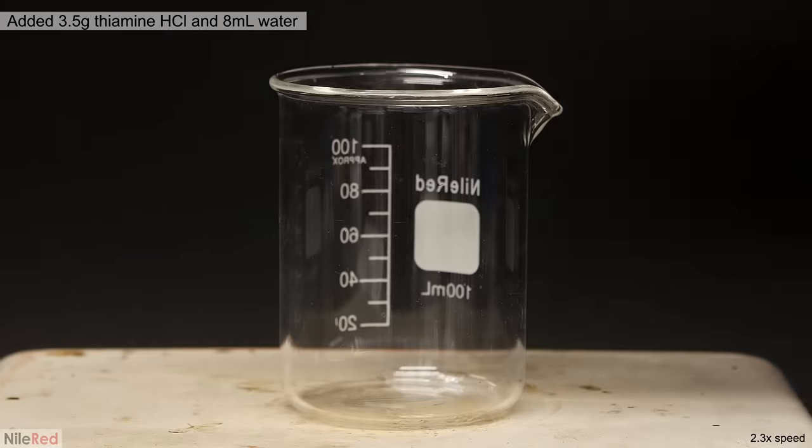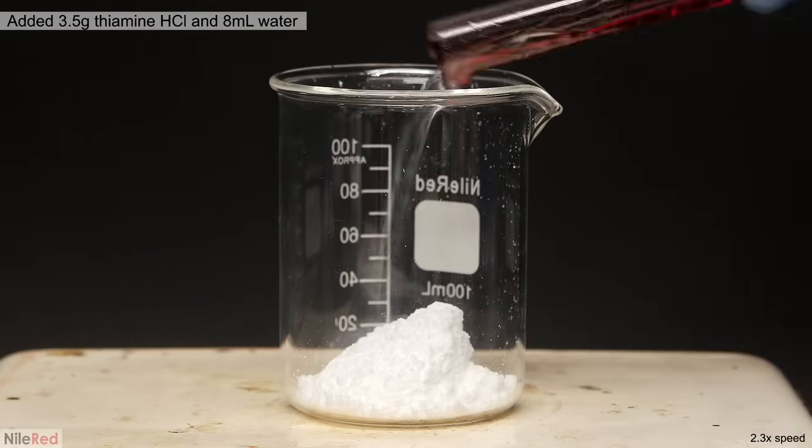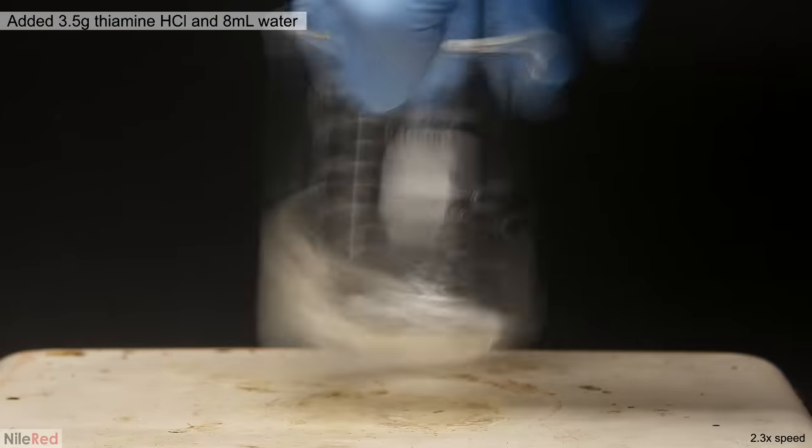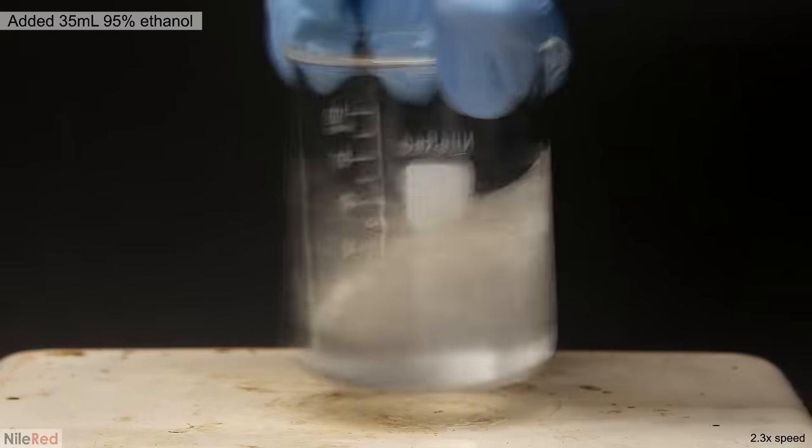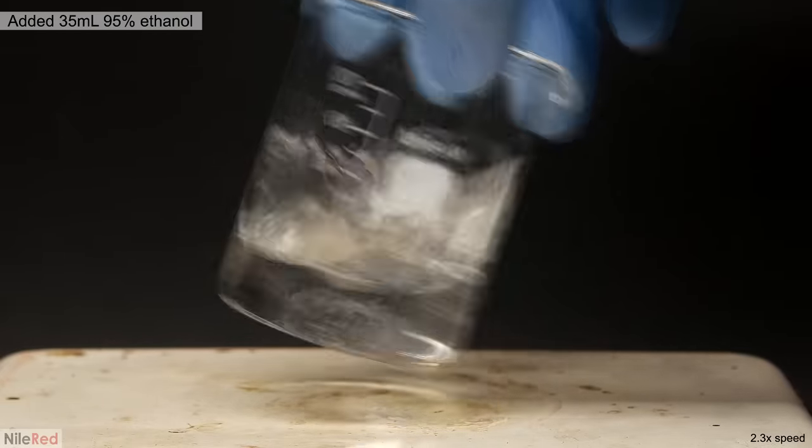For the second one, I added 3.5 grams of thiamine hydrochloride, followed by 8 mils of water. I swirled it around until it all disappeared, and then I added 35 mils of 95% ethanol.